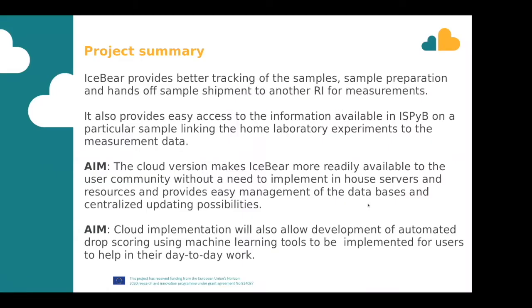So the goals of the project, as a summary, are to improve the tracking of the samples and sample preparation, and then we have implemented hands-off sample shipment to other research infrastructures. So this has been the goal, to track what was actually done to the sample. We have records usually of how the sample was prepared, but then you have to pick up the sample, do some practical things with the sample treatments, and then you ship it to another facility. And we want to keep track of that whole process and make it fluent for the researchers to track this process. And this is implemented already.